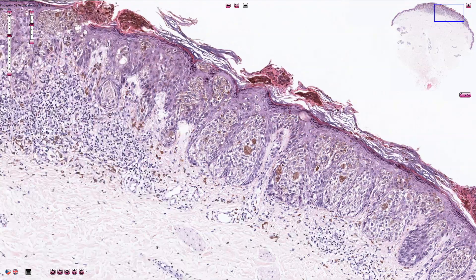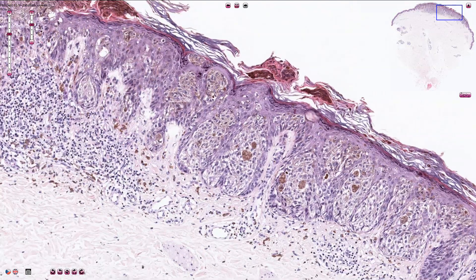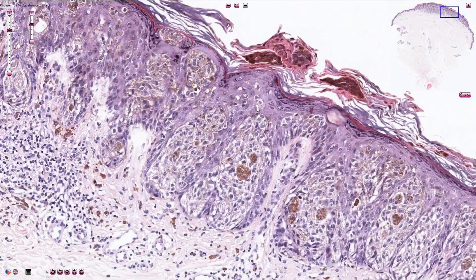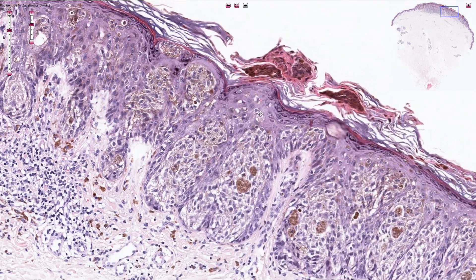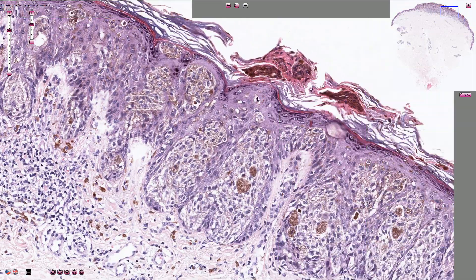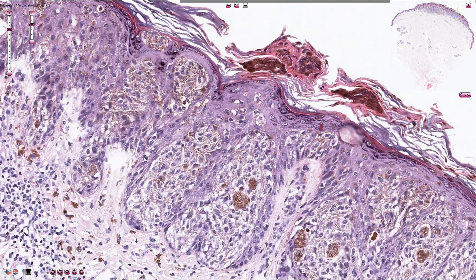Looking at these atypical melanocytes — they should be localized in the basal parts of the epidermis and not here. This is called pagetoid spreading, or pagetoid spread, of the melanocytic cells.